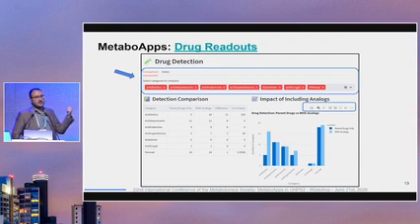Then you have that information here. So you see that in this one, for example, you have parent drugs only and the analogs. That's the frequency of detection in the samples that you have, in this case, for the classes, but you're going to have that for the specific drugs as you check the table or if you change the parameters for that visualization.